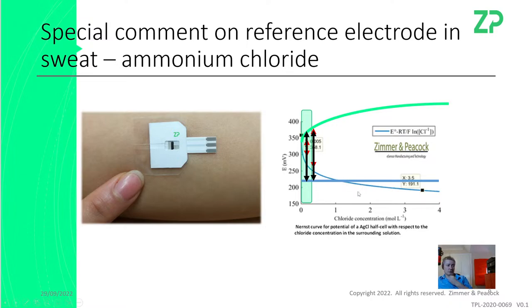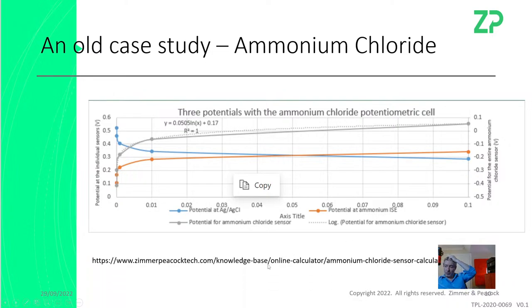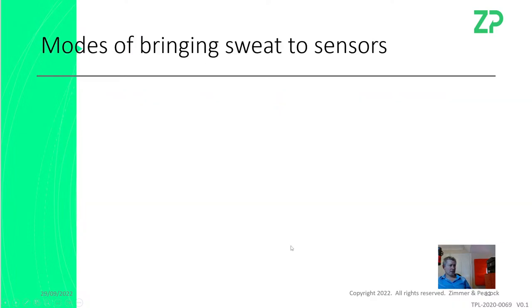So I just want to say that you've got to be careful with sweat, particularly with the reference electrodes, because reference electrodes, if they're silver chloride, are often chloride sensitive. And you can actually use that to your advantage. For example, this ammonium chloride sensor, it was an advantage. Sometimes it just confuses you, because you get a change in signal, but it wasn't due to the working electrode, it was due to the reference electrode. And I do have an old case study on this, and any links that pop up will also be underneath the video.